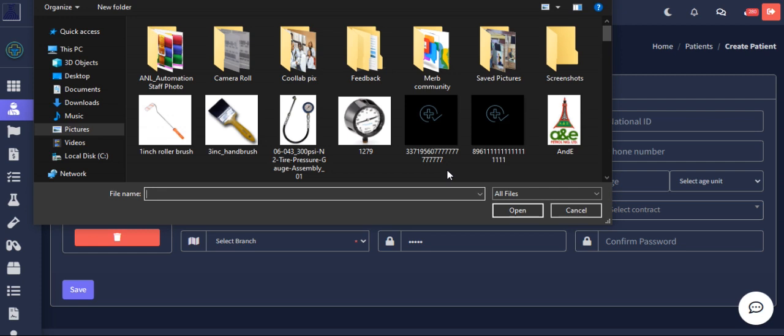If for example we have actually taken the picture of the patient, some people like to take the patient's picture while they are standing there. But if you have their photograph in your previous system, you just pick up the photograph and attach it there. But if the patient has just walked in and you don't have their passport, you can snap them and save it in the computer.